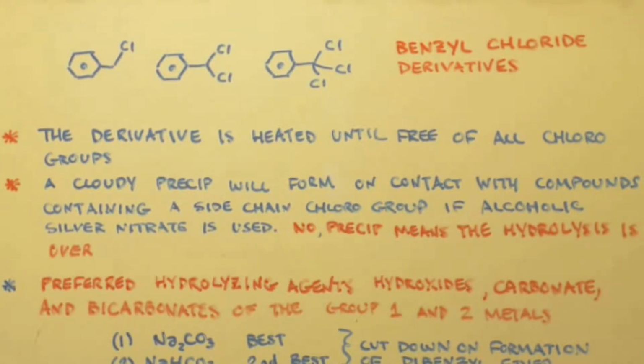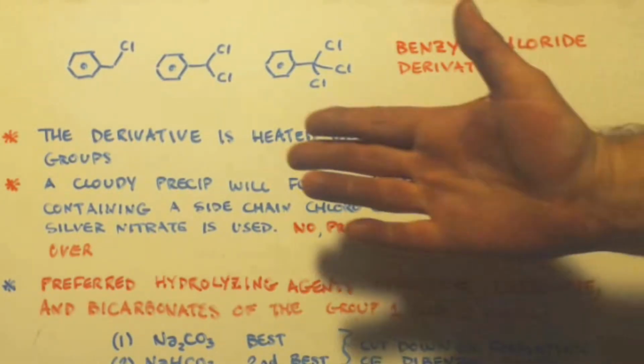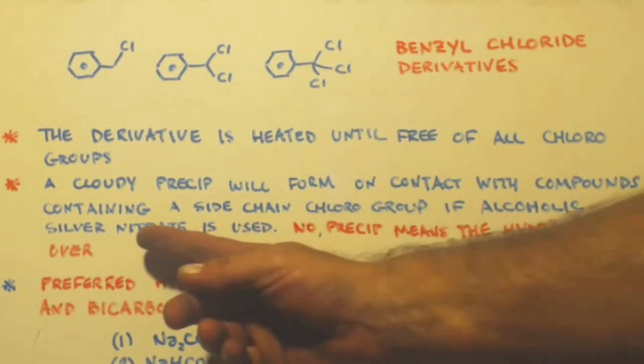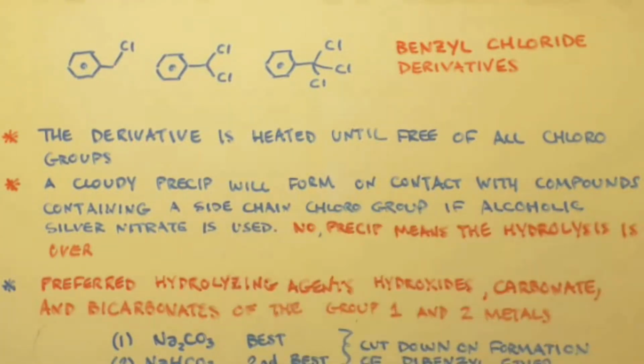Now I'm just going to go into some facts about hydrolysis, and then I'll tell you what I plan to do. These are generic things. I'm talking about all three of these in general. The derivative, meaning one of these, is heated until free of all chloro groups. So you're just basically heating it up. A cloudy precip will form on contact with compounds containing a side chain chloro group if alcoholic silver nitrate is used. So if you want to test, you're doing your hydrolysis, you're refluxing it, you're heating it, now you think you're done. You could get a little sample out, mix it with some alcoholic silver nitrate, and if a precip forms, that means there's chloro groups. If no precip, then your hydrolysis is complete. Okay?